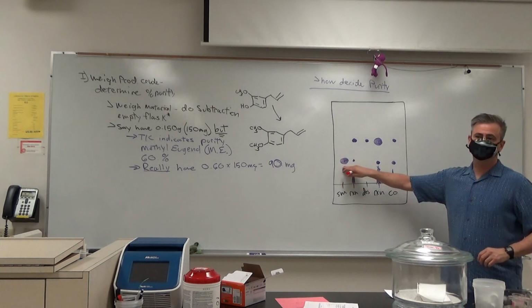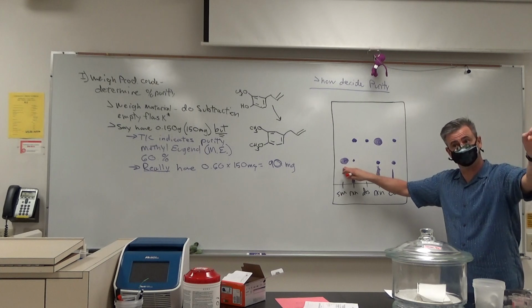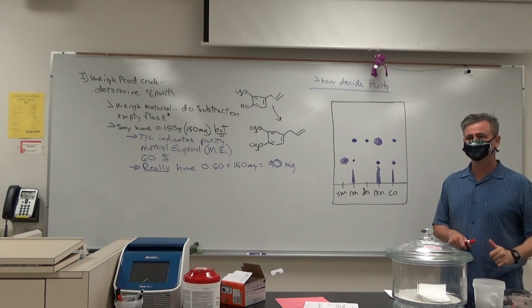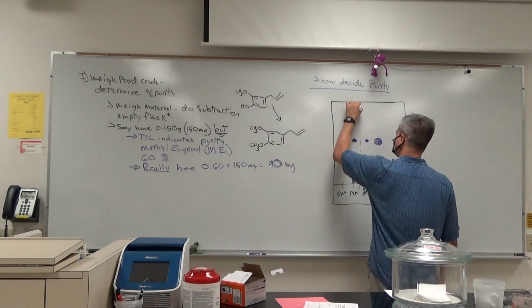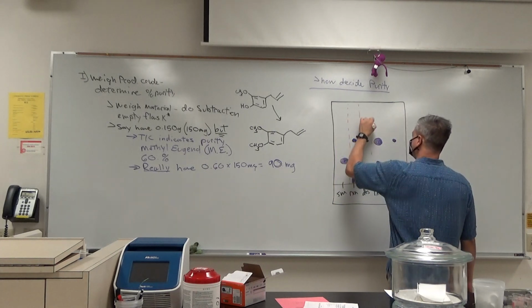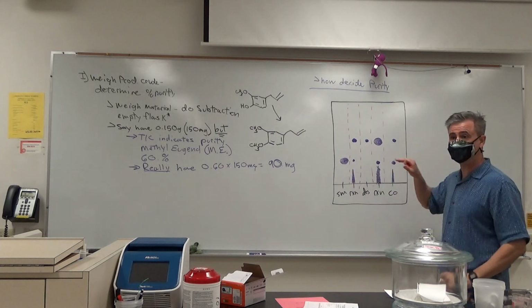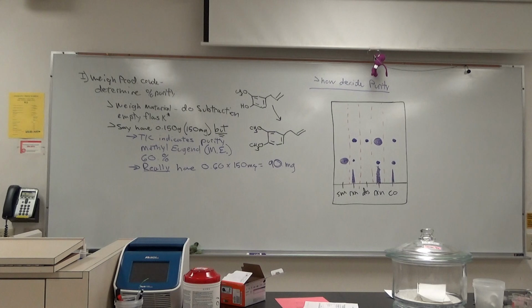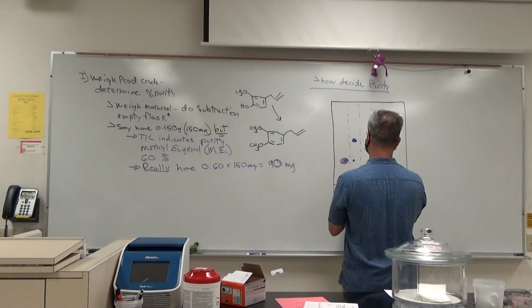This has nothing to do with your reaction crude. This is a bottle that we had on the shelf upstairs that we put in there. Students do that all the time. That's why I made that spot so big. We sometimes call these lanes. The only thing that tells you about your reaction crude is what's in the lane. These just help you identify your lane, or the stuff in your lane. So now, remembering that only this tells us about our stuff.